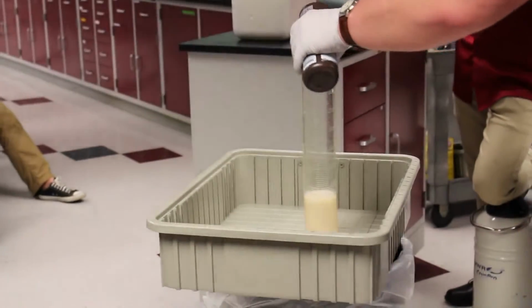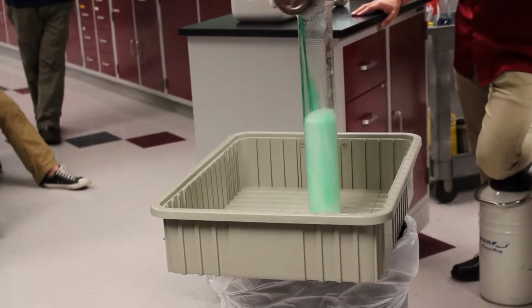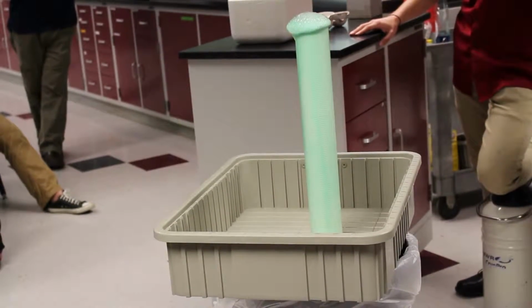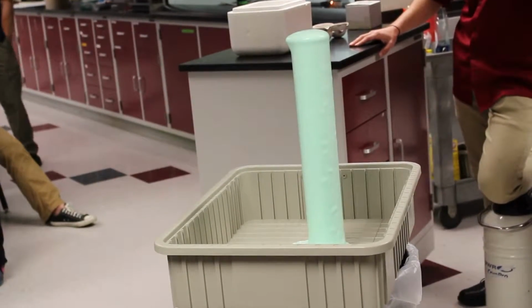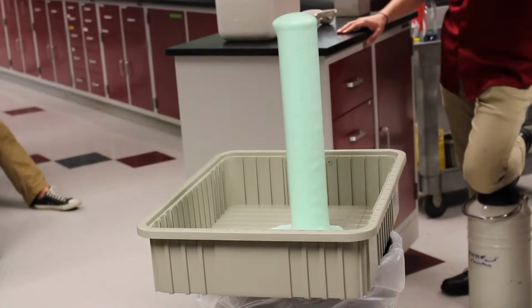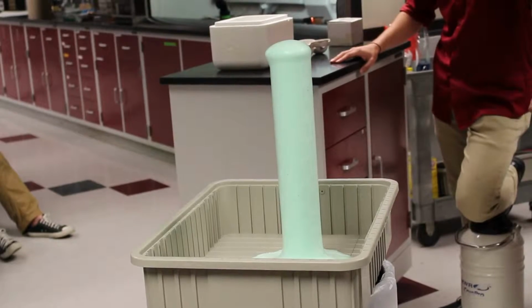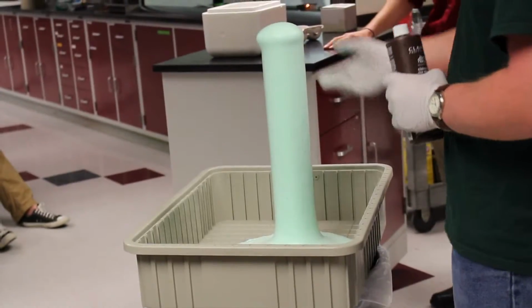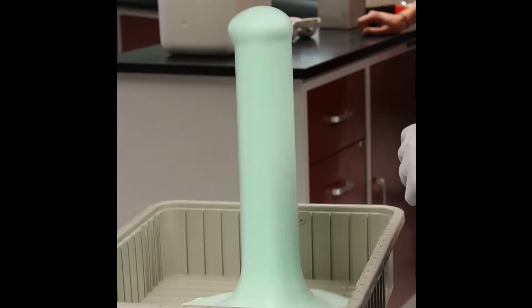Anyway, you add them together, and what happens is the hydrogen peroxide loses one of its oxygens. The structure for hydrogen peroxide is two oxygens bonded together, with two hydrogens coming off. The yeast catalyzes the reaction to lose one of those oxygens, and then it's just forming good old water. But that oxygen is free floating, and it joins up with another oxygen coming from another peroxide, and you've got O2 gas. Especially since it's catalyzed, it's a lot quicker. That's the point of a catalyst. You get your reaction to go a lot faster.